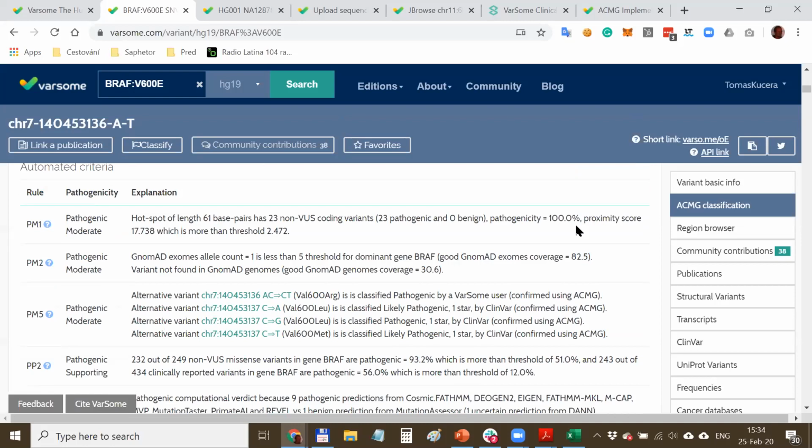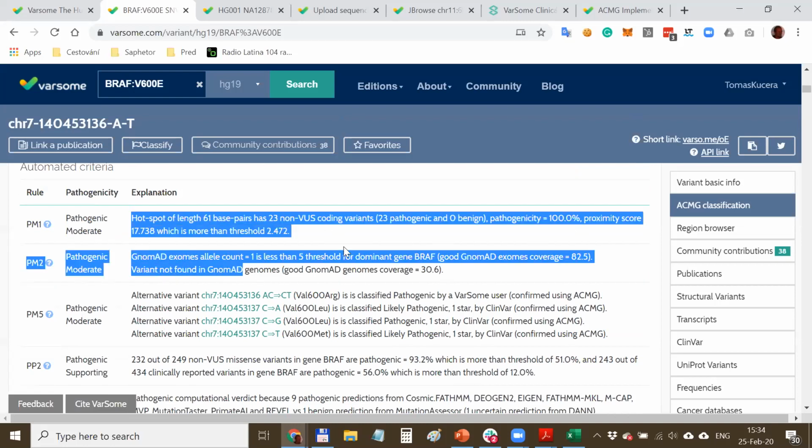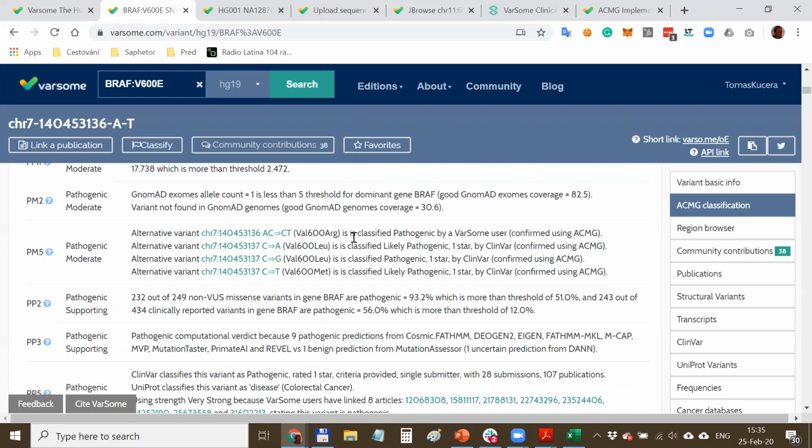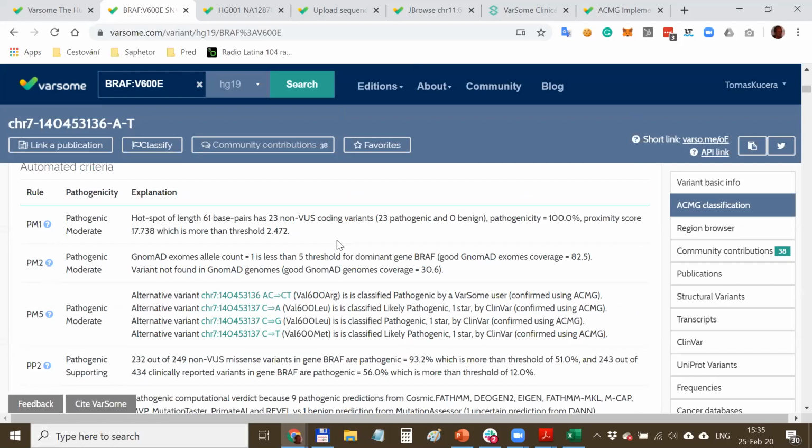Second, it's also a very transparent implementation. For each criterion here, it tells you in great detail, in plain English, why a given criterion fired or didn't fire. This allows you to review each particular situation and possibly make your own judgment call in line with your best knowledge.